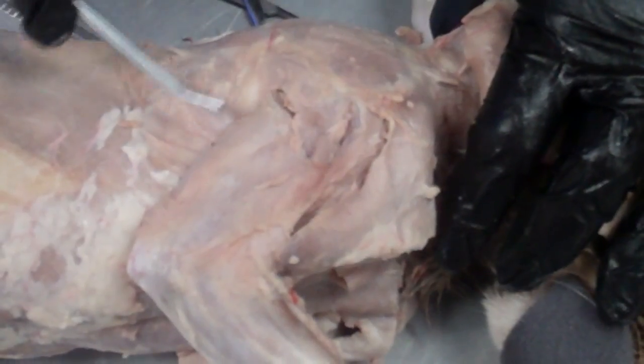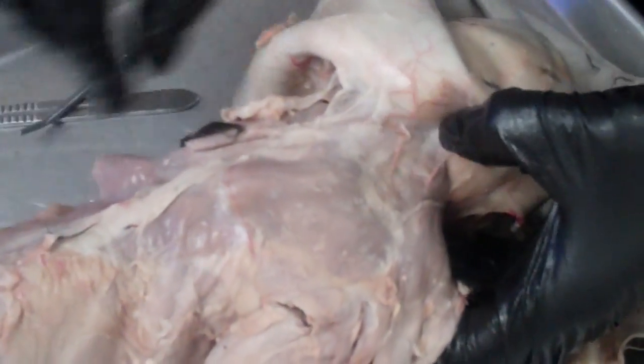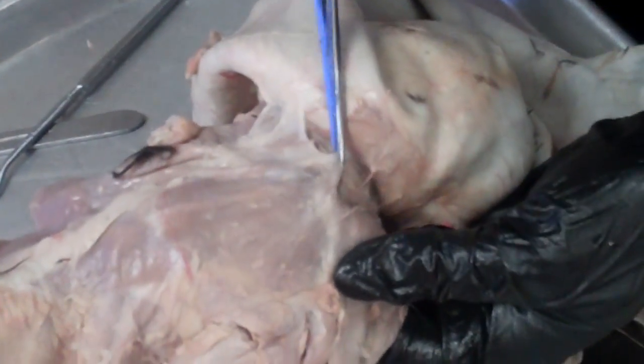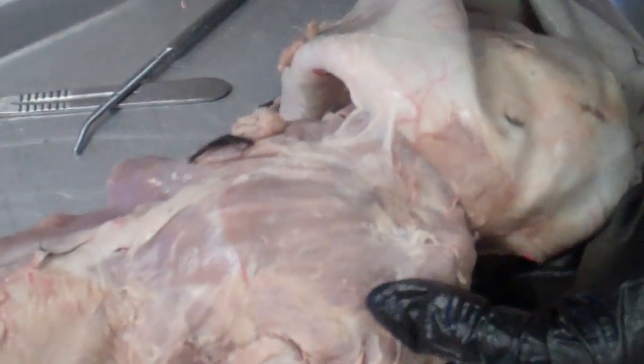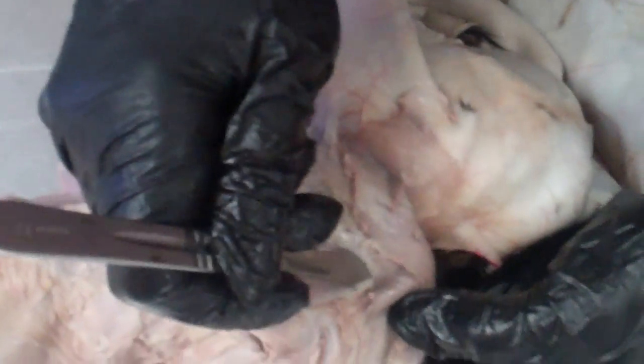Now we're going to look for the trapezius muscles. The trapezius muscles are going to go more on the back. As I pull this down, I want to look for a place where the clavotrapezius is going to be separated from the other trapezius muscles — if I pull down here I should be able to see a place to make a natural separation.